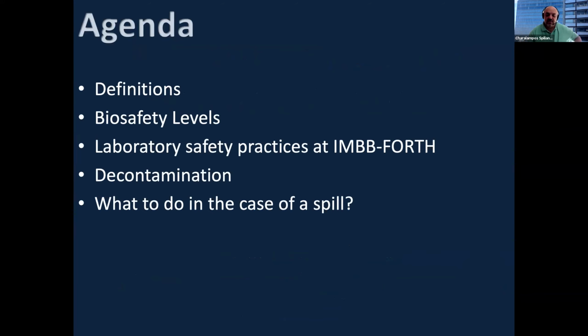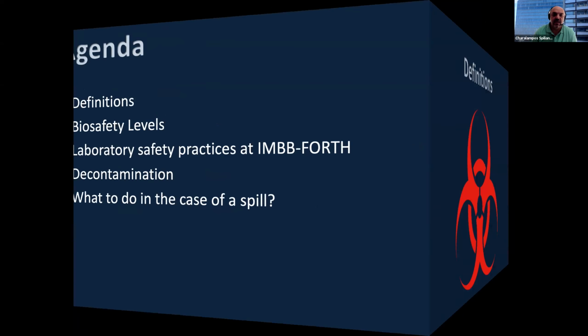So today we're going to be talking about the different biosafety levels that a laboratory can belong to, depending on the reagents it deals with. I'm going to remind you about the safety practices that you have to follow in our laboratories. I'm going to give you a couple of recipes and ways to decontaminate either areas or equipment. And at the end, I'm going to talk again about what to do in case of a small or a large spill within the laboratory.